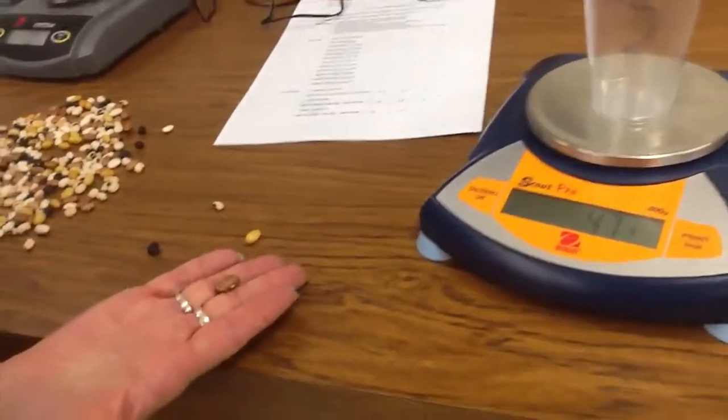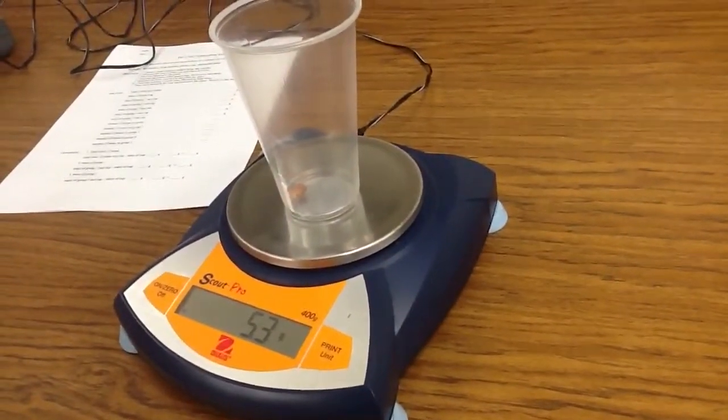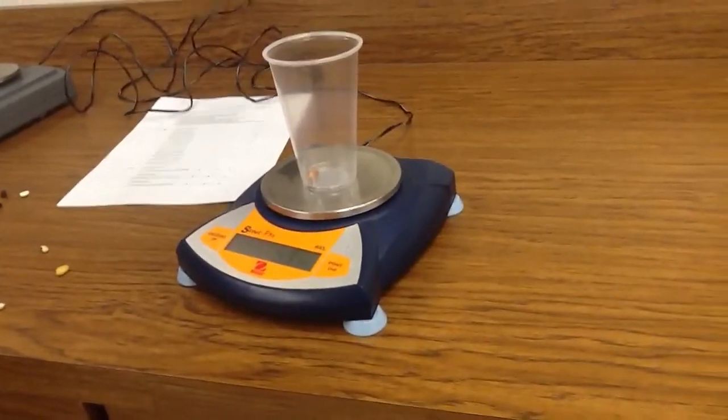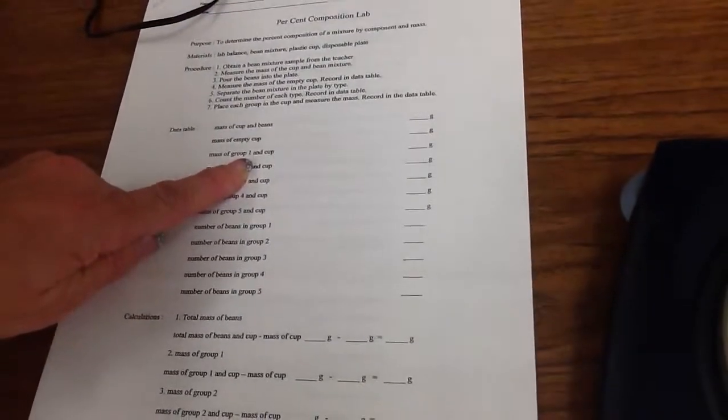Then when you get all of your speckled beans, put them in the cup and weigh all the speckled beans together. You'll record that for mass of group one. On your lab sheet where it says group one, give it a name. Speckled beans.